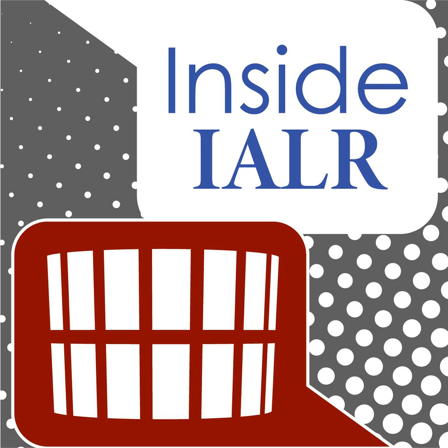The range of different things we can do is almost infinite, because you can think of the different types of cameras you can use. You can think of even experiments, like people say plants grow better when they have music playing. So we could look at that if we wanted to. Most interestingly though, we've been looking at plant movement.